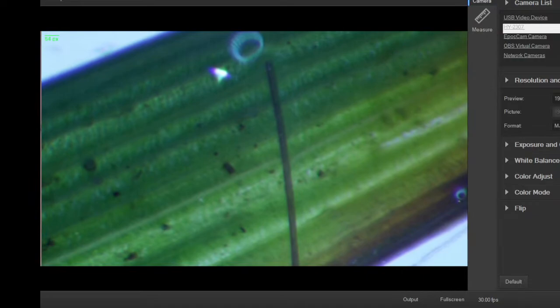I'm hunting rotifers. There it goes. Now it's swimming off to the left side. That stretching motion is totally rotifer. Cruising off sides there.